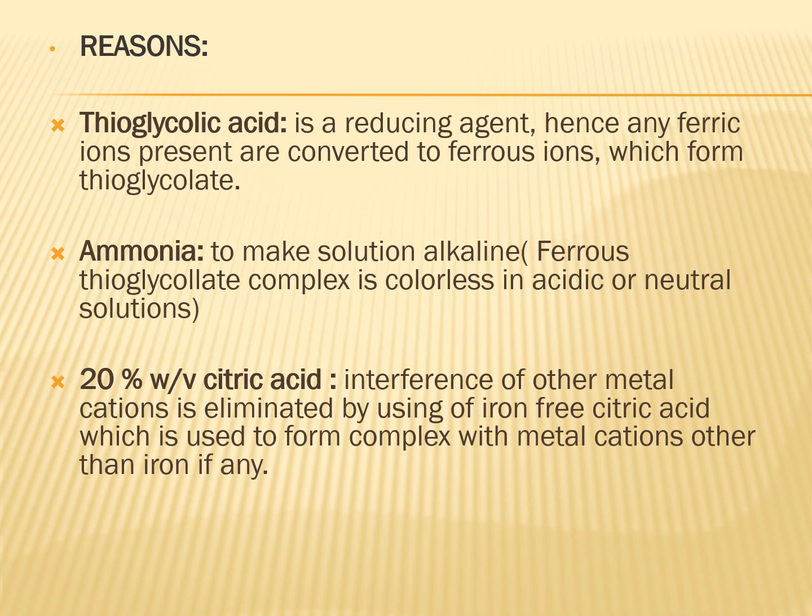Next, the reason behind adding the various reagents. First is thioglycolic acid. Here the thioglycolic acid is a strong reducing agent. So the ferric ion present in the sample solution is converted into ferrous ion, which reacts with thioglycolic acid to form the ferrous thioglycolate complex.